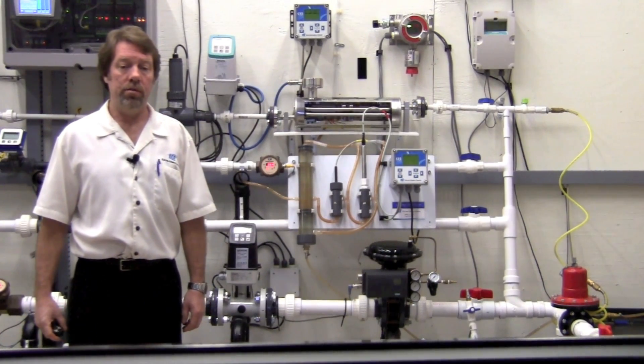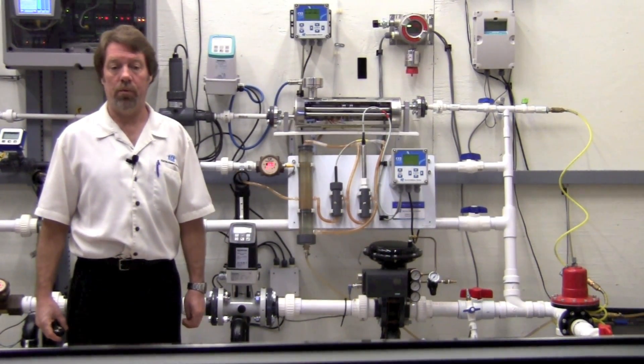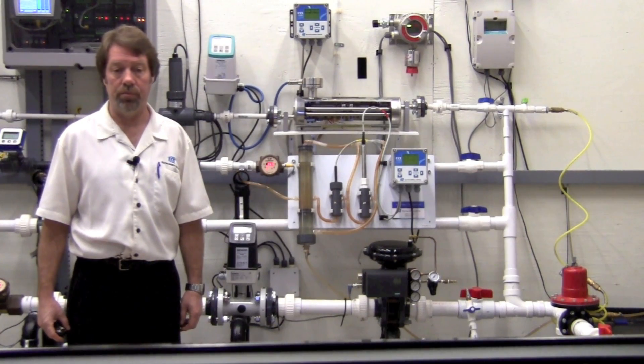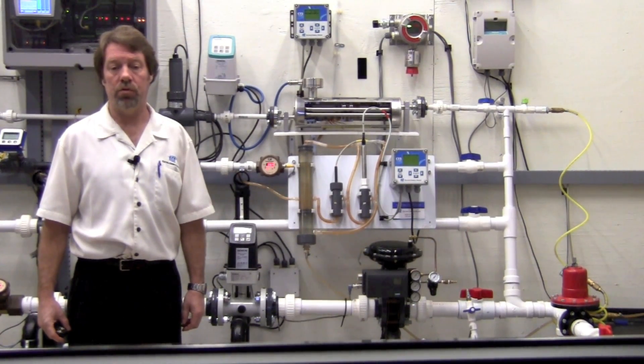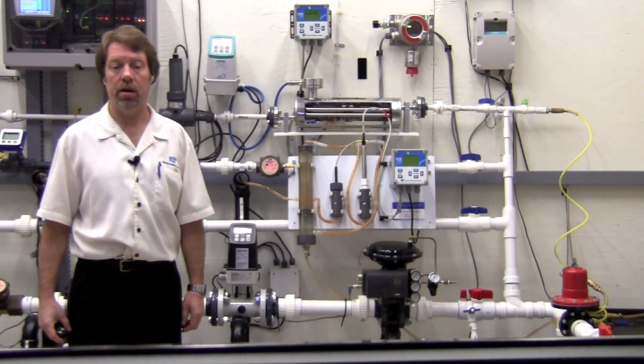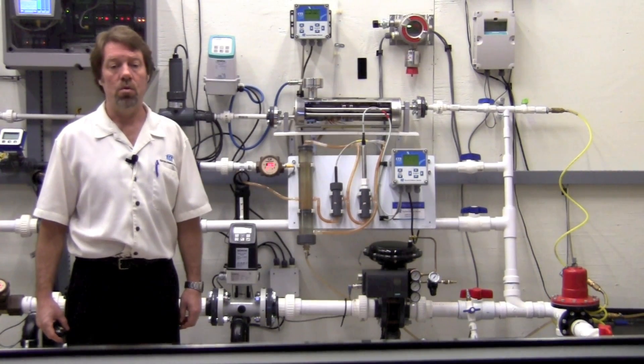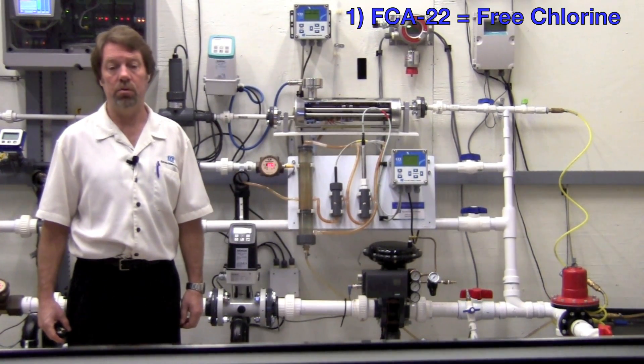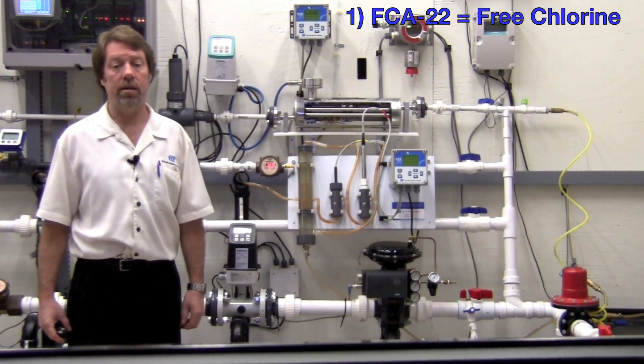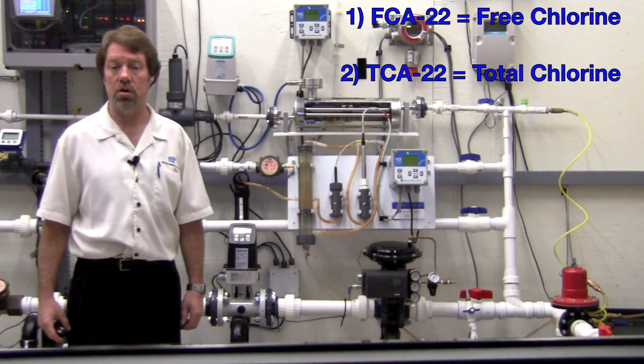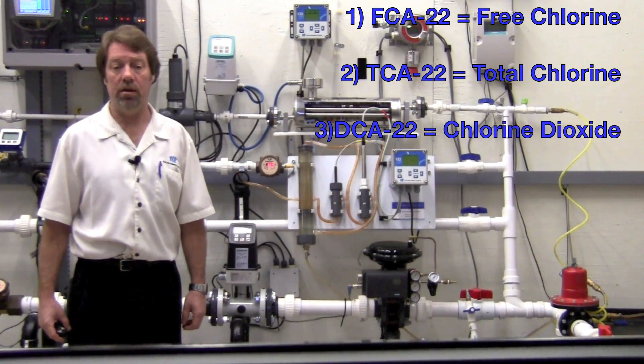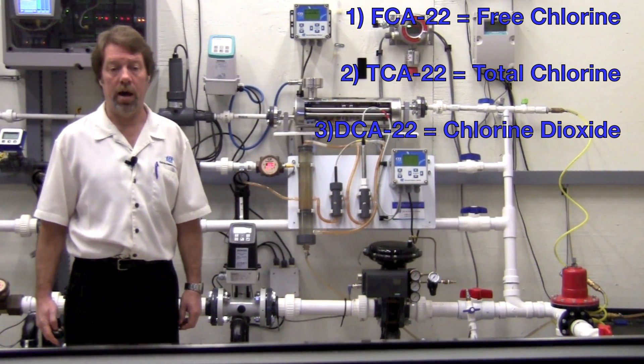The chlorine systems are a complete and ready-to-use chlorine monitoring and control system. The systems can be used for one of three measurements depending on the chlorine sensor being used. We've got the FCA-22 which is for free chlorine, the TCA-22 which is for total chlorine, and the DCA-22 which is for chlorine dioxide.